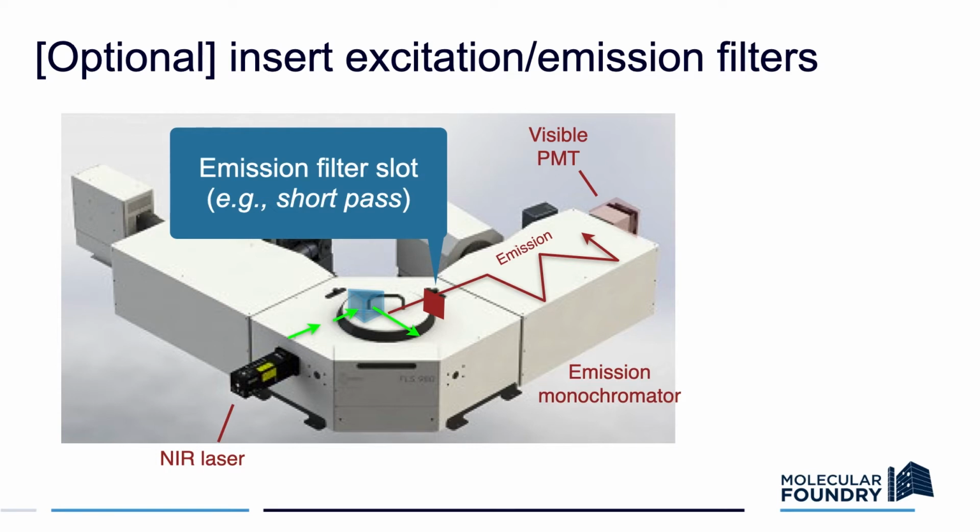A wide variety of interference and colored glass filters are located in the cabinet below the Edinburgh spectrometer. You should ask a super user for permission to access these filters. For the circular filters like Semrock 25mm filters, they need to be mounted inside of a Thorlabs cage cube mount. This can be a little tricky because these cage cube mounts weren't meant to be used with the Edinburgh filter holders that are shown in this slot. You should ask a super user how to fix the cage cube mount onto the Edinburgh filter holder.